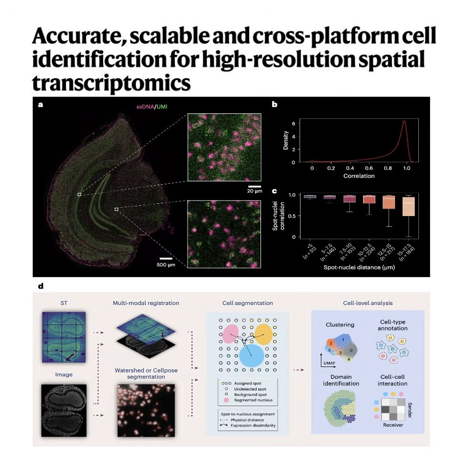It really is. All right, so we have this mathematically elegant system, but an algorithm is only a theoretical equation until you test it against the messy reality of biology. How do we know Cellist actually works? Well, they ran rigorous benchmarks on a mouse brain Stereo-seq dataset, but they immediately hit a wall. There is no ground truth. Right, we don't have a magical master key showing exactly where every cell border is in a slice of brain. No. So they had to use clever proxies to grade the evidence.